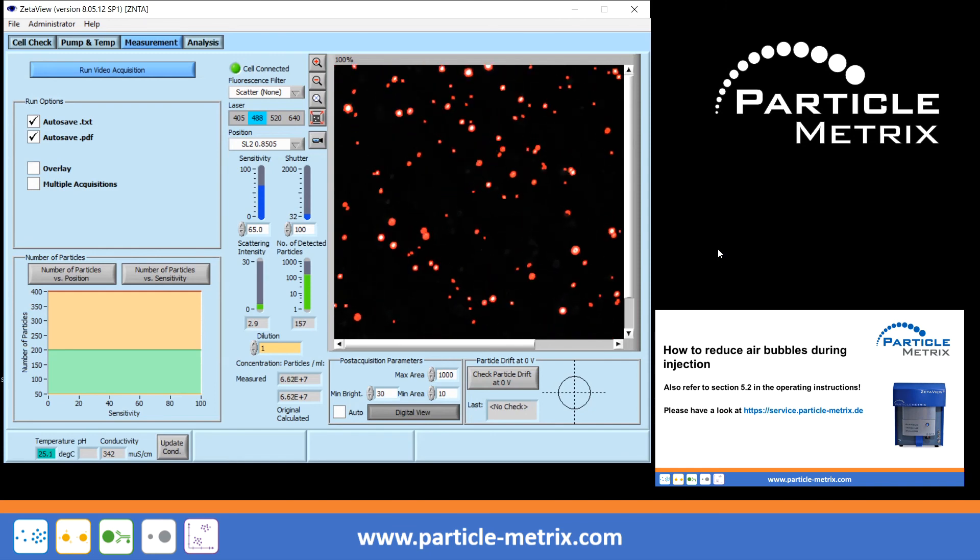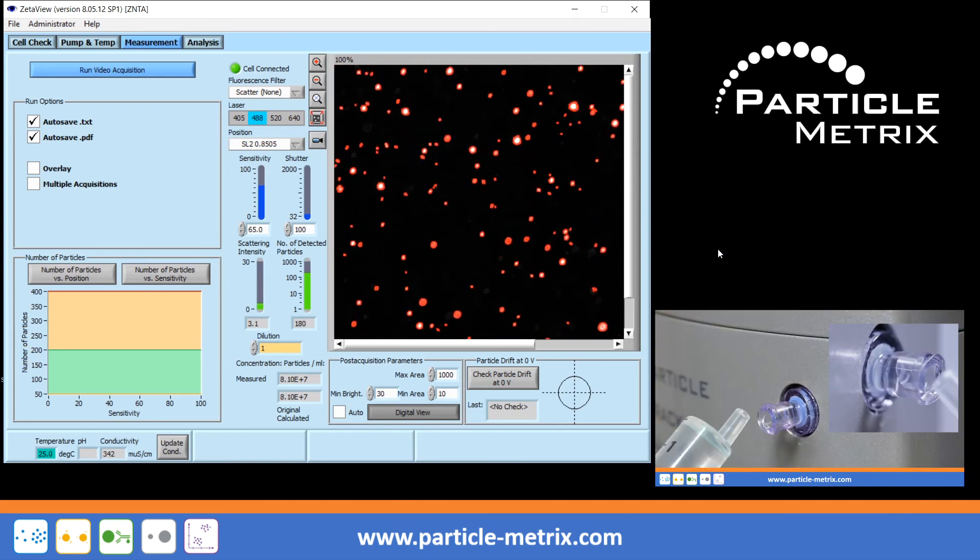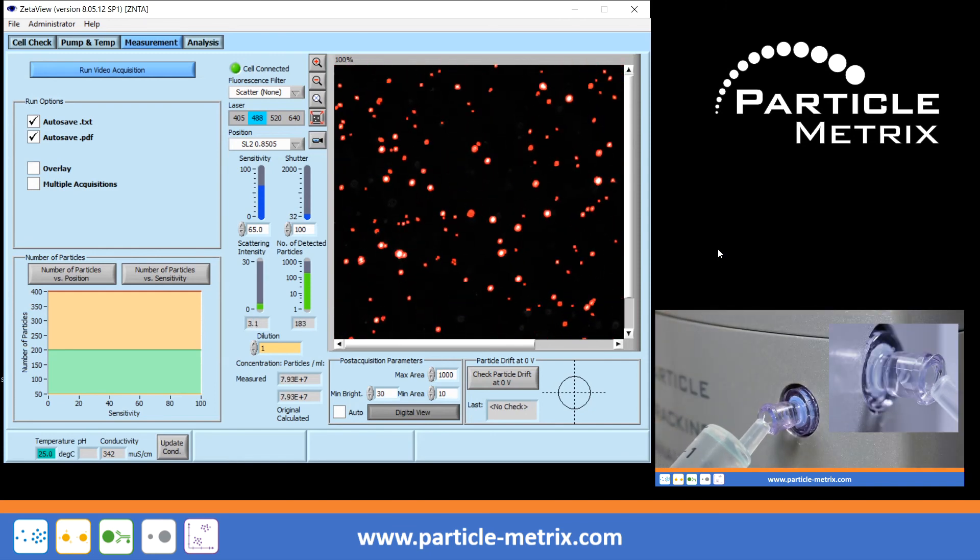Please also refer to our video tutorial that describes how to reduce air bubbles during injection.